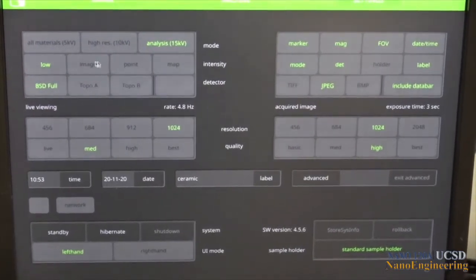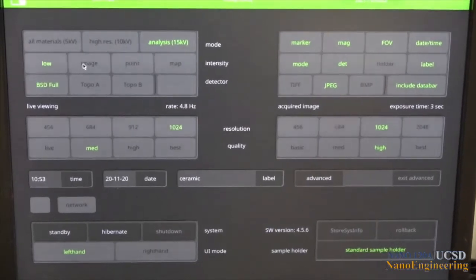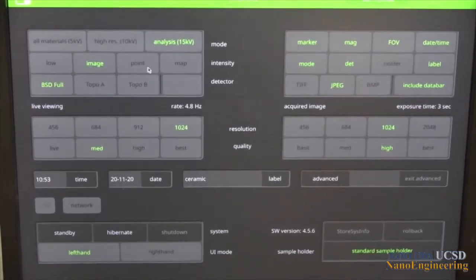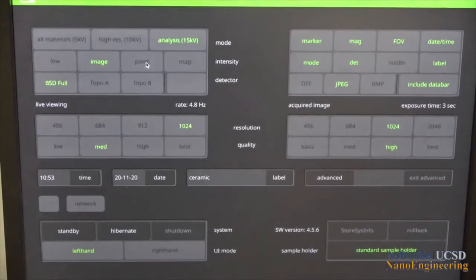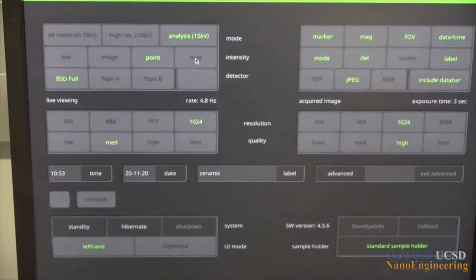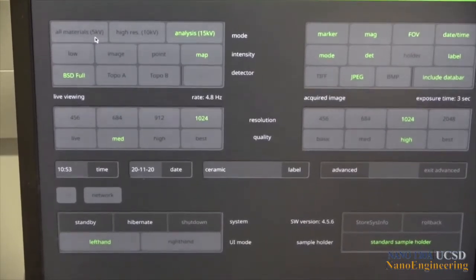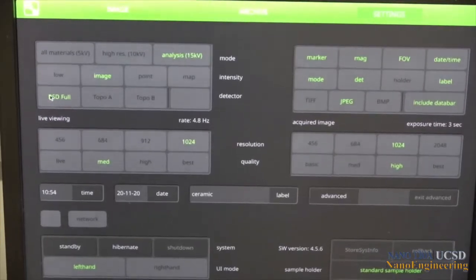The boxes labeled intensity control the beam current and spot size in the SEM. Low provides a lower beam current and spot size for samples which may be beam sensitive or experience charging effects. It can also be used for high resolution imaging. Image uses a higher current larger beam size for most types of imaging. Point and map select high and maximum beam currents for X-ray analysis.